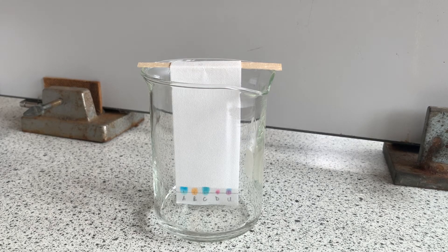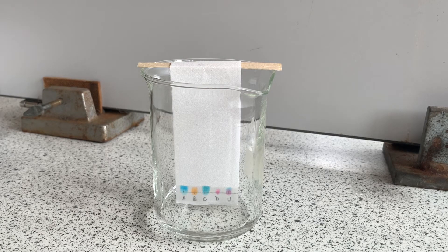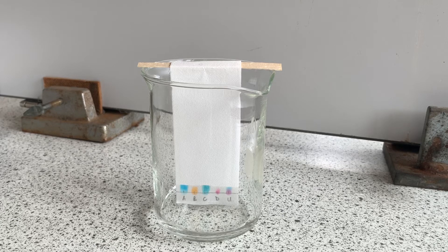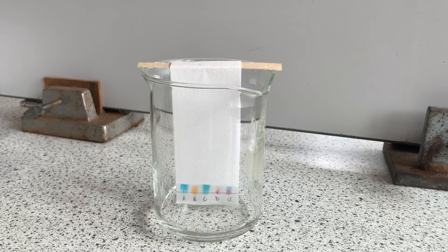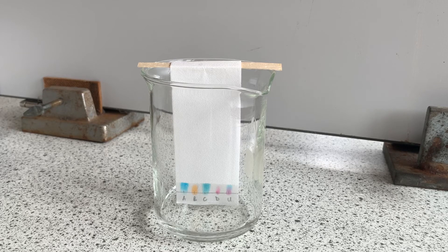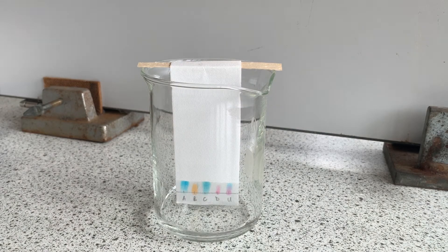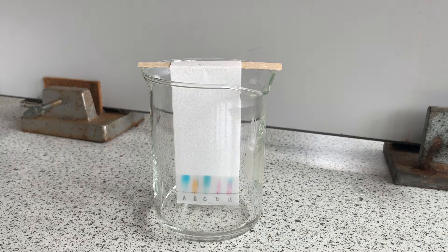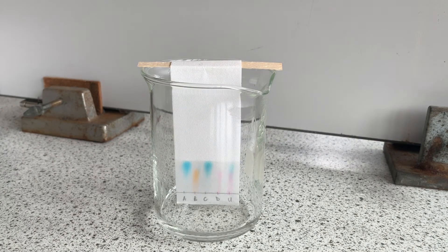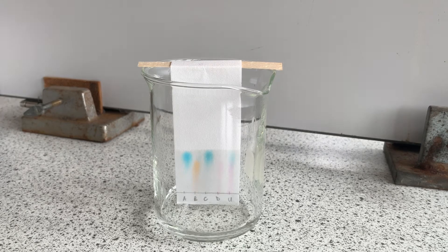Compounds are more soluble in some solvents than others and remember the more soluble a compound is the further it will travel up the paper. Water is found to be a good solvent for these compounds because their different solubilities mean that they travel up the paper at varying distinguishable distances which you can see happening now. I've fast forwarded the video to get to the end of this chromatography.